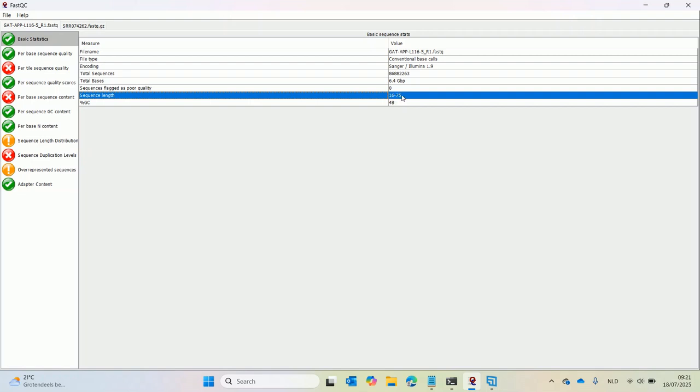Where does this come from? Well, it comes from the fact that the bases2fastq tool can also remove adapter sequences from your reads. By doing this, it will shorten the reads, and that's exactly what you see here. That's of course not a bad thing. You have to remove the adapter sequences from your reads, but you have to double check with your sequence provider to see if this is indeed what happened with your data.